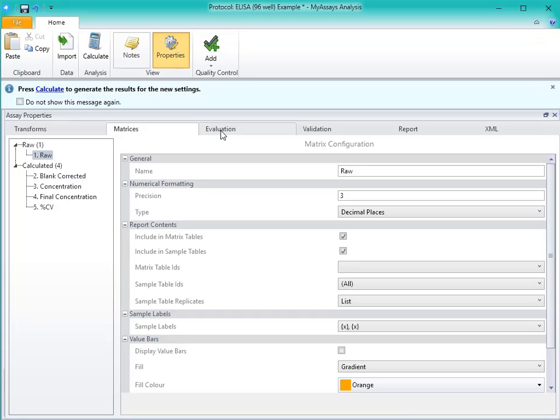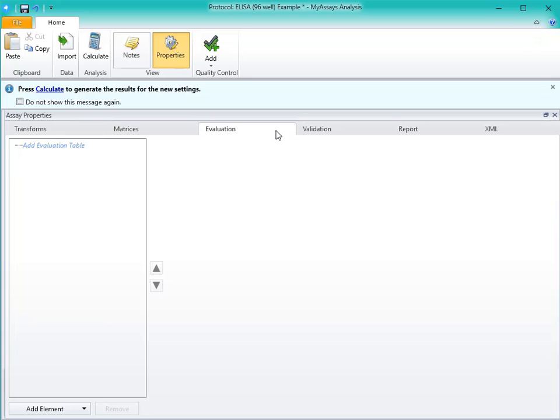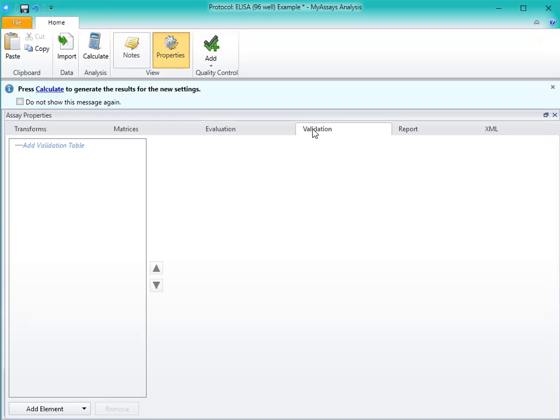You can use the Evaluation and Validation tabs to set up various evaluation and validation tables. Evaluations are useful for reporting various values from your protocols, including transform output variables or TOVs. Validations can be used to ensure that certain criteria are met, such as making sure that your controls fall within a specified range or that your R-squared is greater than 0.9.